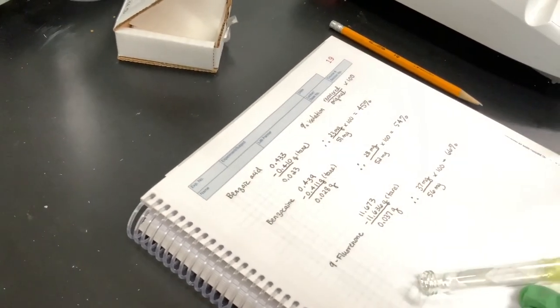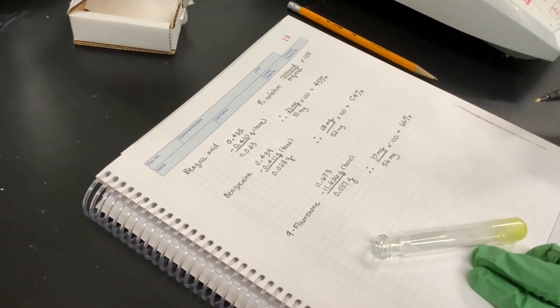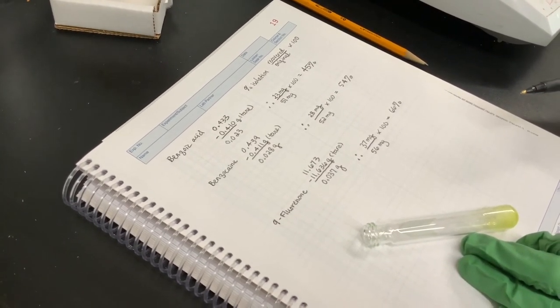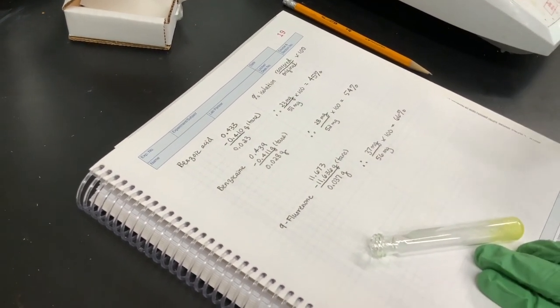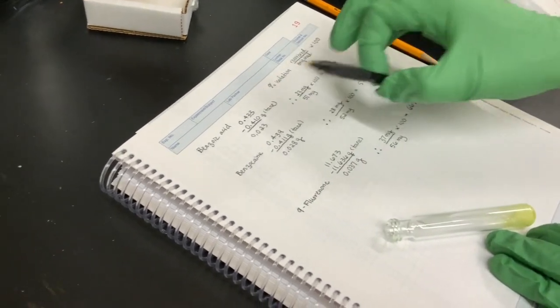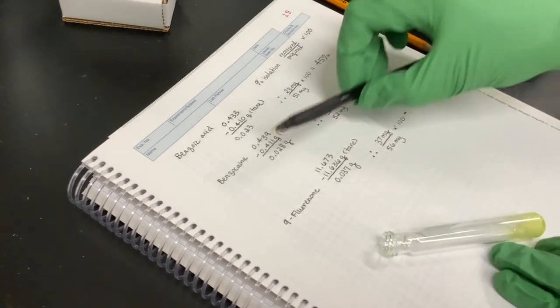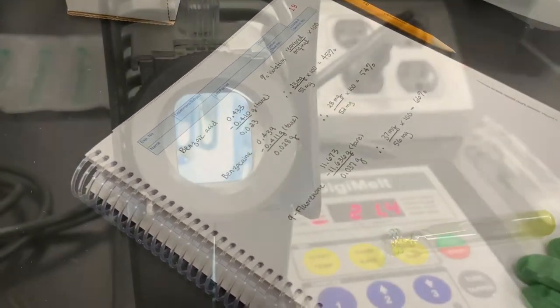And in order to assess how thorough the separation was, we have to take the melting points of each solid, right? And so if we did a great job at really separating one from the other, the melting points of each of these three solids should match the literature. Okay, so we have to acquire the melting points now of our three compounds we isolated to make sure they are what we say they are.